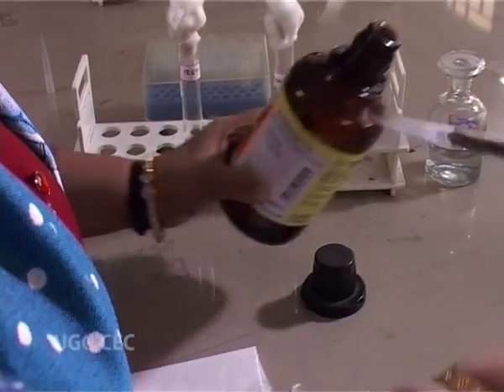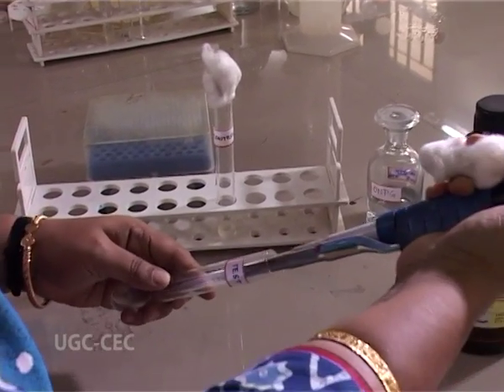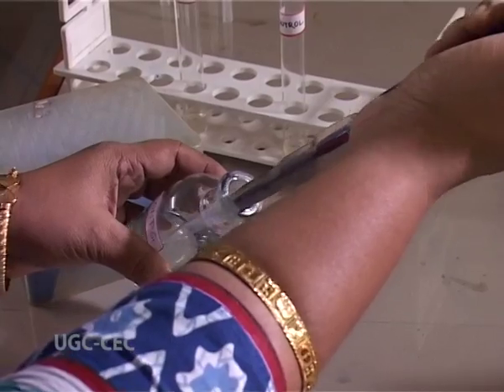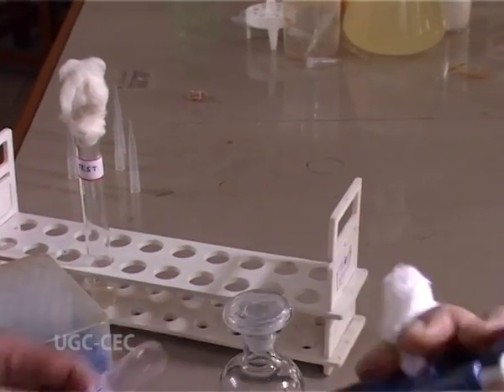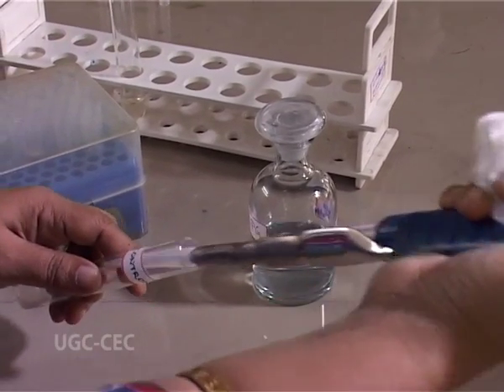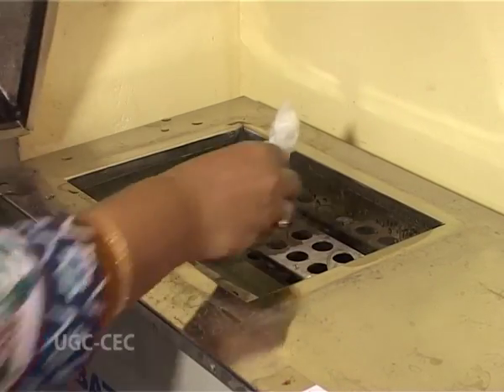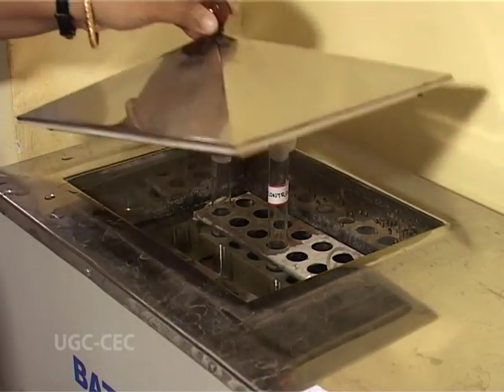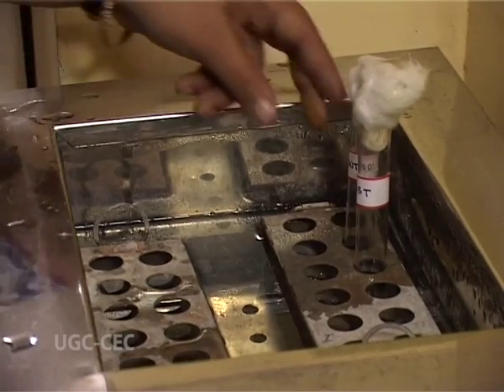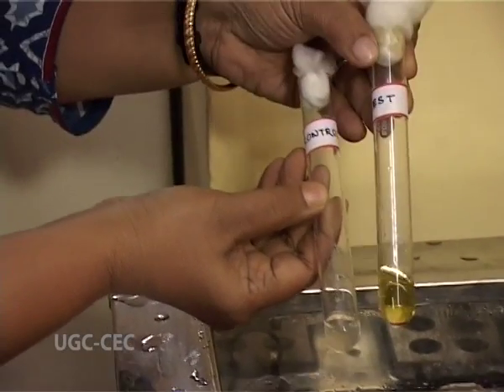After this, the next step will be addition of toluene or methyl benzene. This is done by adding 3 drops of methyl benzene. Before we transfer the tubes onto the water bath, 2 ml of ONPG solution is added to each sample. Then it is incubated in a 37 degrees centigrade water bath incubator for 20 minutes. We will see that the tube that contained cells grown in presence of lactose developed yellow color. On the other hand, the tube that was grown in presence of glucose only didn't develop any yellow color.